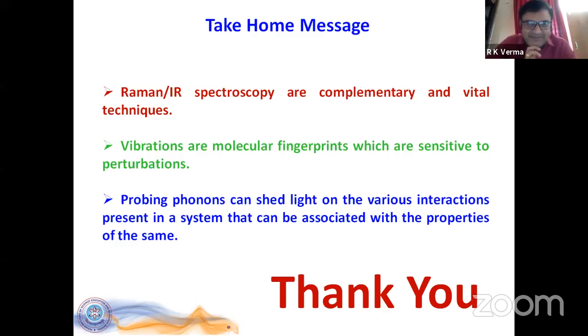There is one question from Nancy. She is asking, can we identify the possibility of Raman resonance in any material before taking Raman spectra? Yes, one can actually make a smart guess. For example, if we know the band gap of a material, and if I have the scope to choose or select a laser which is very, very close to the band gap energy, then I may be able to hit the resonant process.